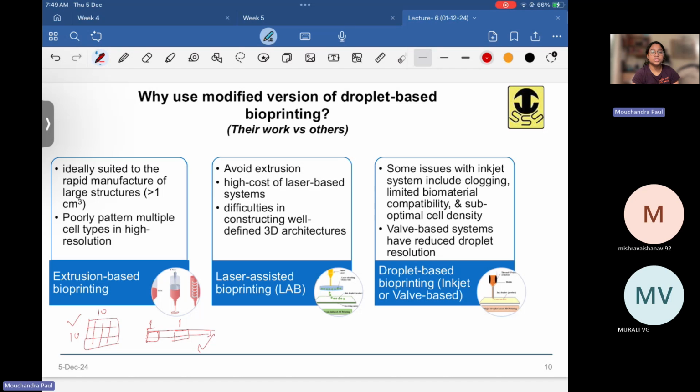You can control the G code in a better way. Here, controlling the G code means controlling the movement of the XYZ axis to make sure that you get exactly this type of pattern. It is a bit more challenging.